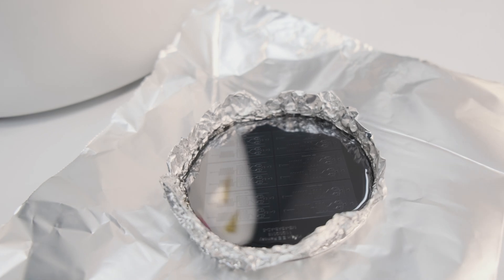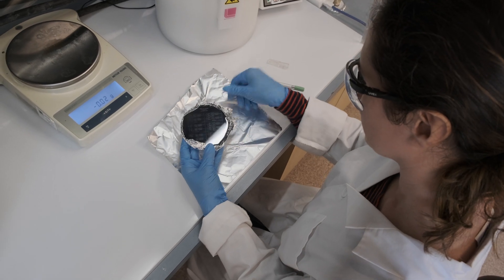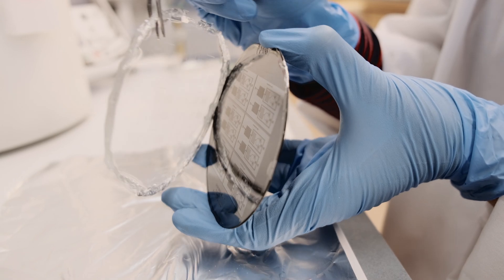The best way to visualize microfluidics is to think of a tiny little piece of plastic around the size of a postage stamp and imagine on there you can build tiny little pipes and little chambers. Think about like the width of a human hair, so really small, and we use them to do chemistry or biology on really small scales.